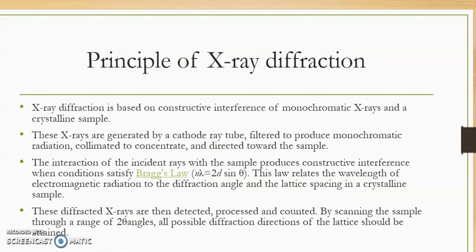Principle of X-ray diffraction. X-ray diffraction is based on constructive interference of monochromatic X-rays and a crystalline sample.